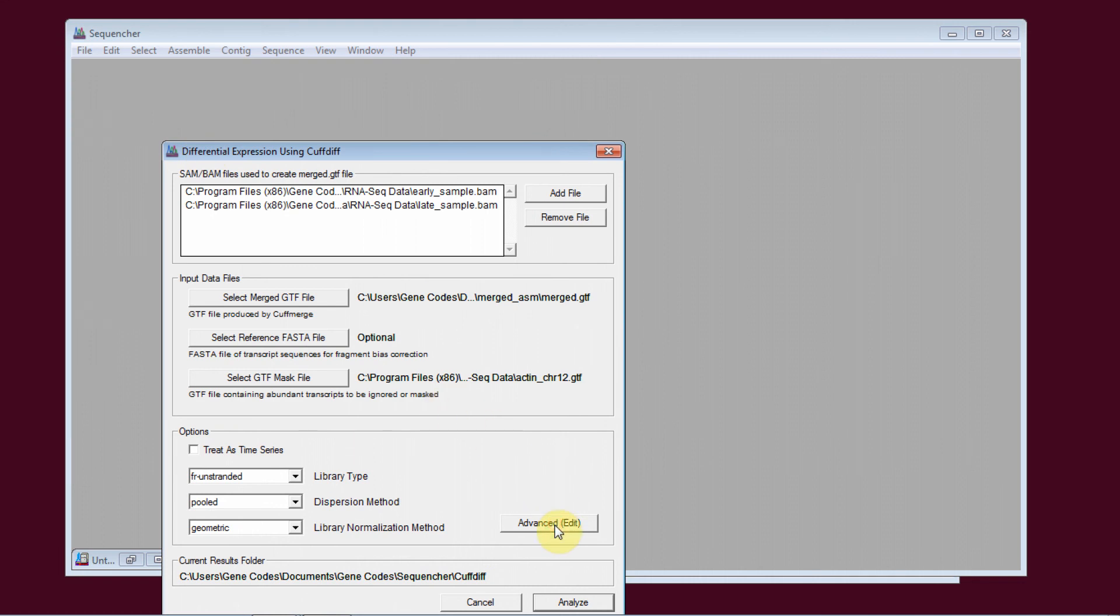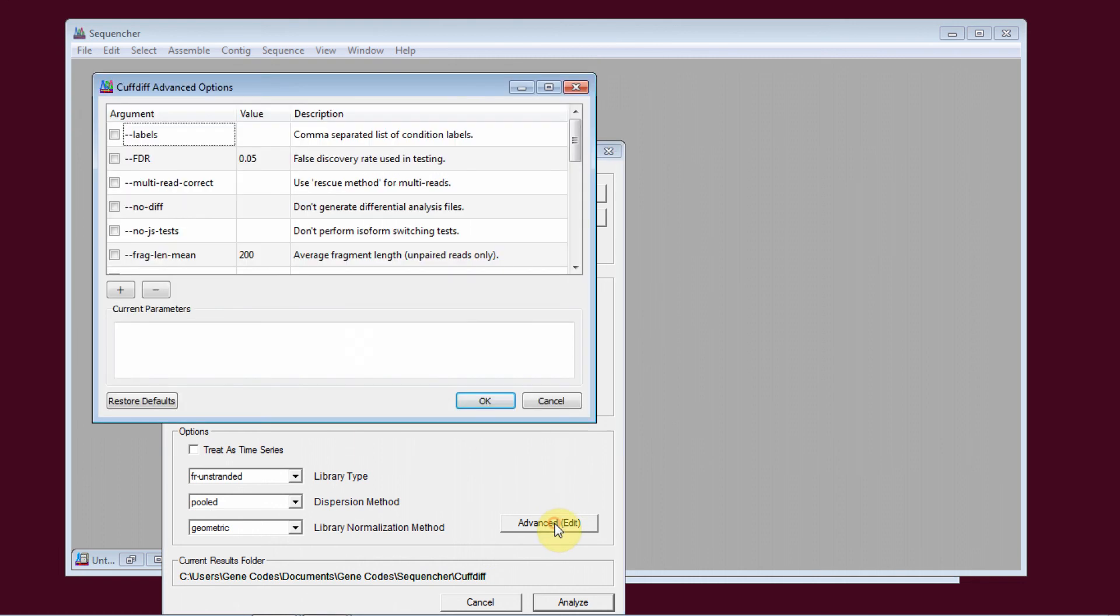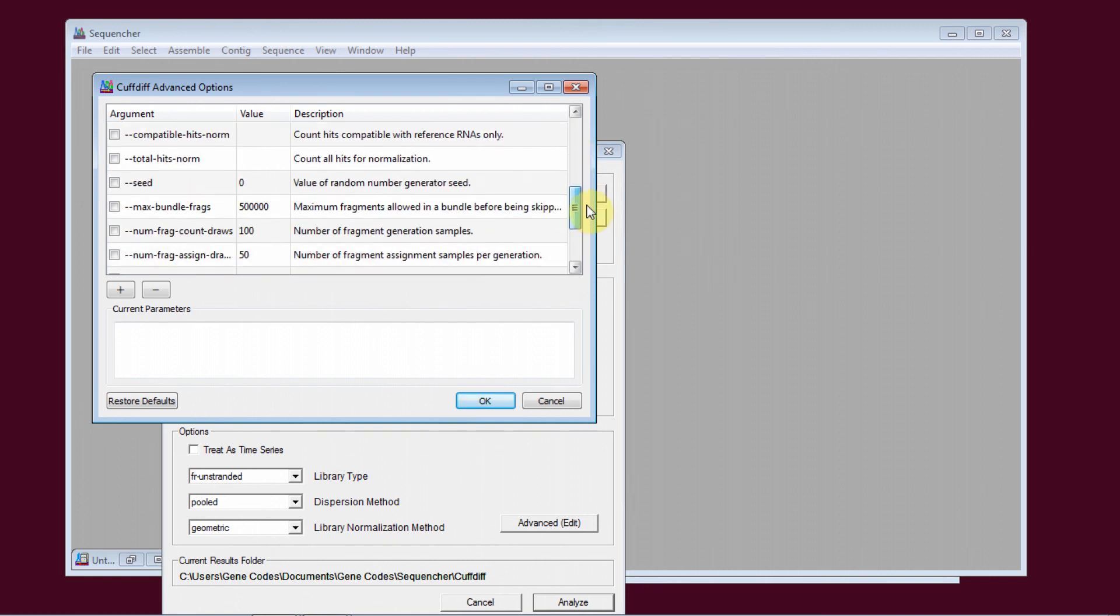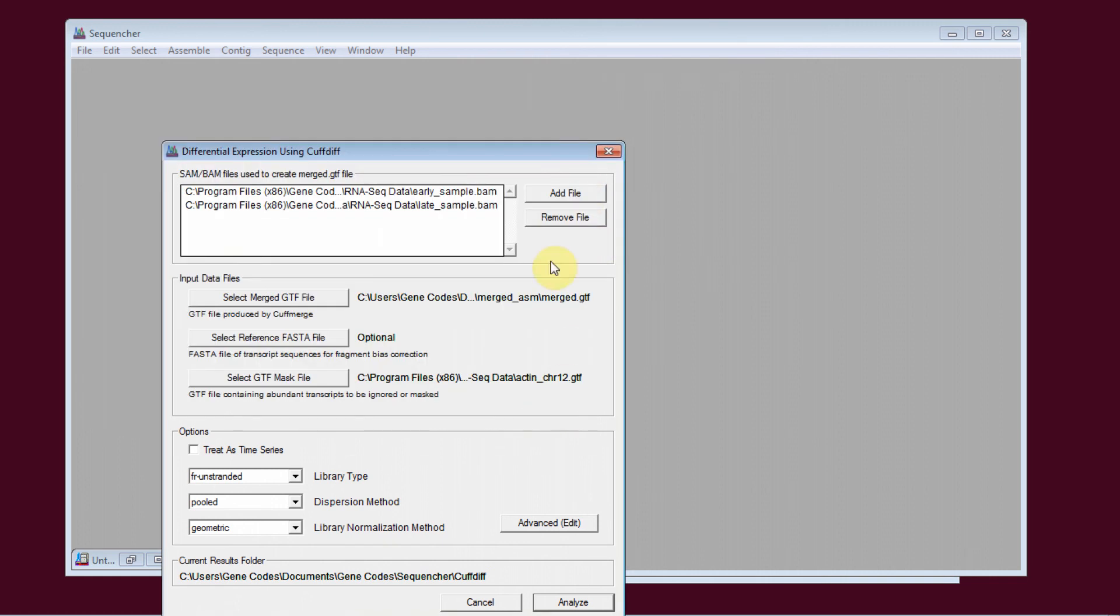I'm going to select a file as a GTF mask file. I also have some advanced options that I could use if I was interested in doing that. But for right now, we'll just go ahead and use the default options and click Analyze.